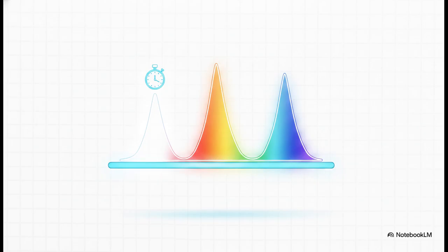So once the instrument has done its job flawlessly, the physical chemistry ends and the data analysis begins. The output we get is a graph known as a chromatogram. You'll generally see a flat baseline with sharp peaks spiking out of it. To make sense of this, you really just need to focus on 2 things. First is retention time. Literally the exact minute and second a peak exits the column.